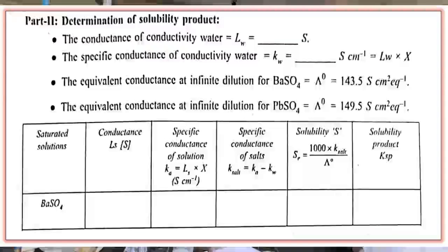Similarly, we can take another salt also, lead sulfate or any sparingly soluble salt, and we can determine the conductance of that sparingly soluble salt. So the experiment is very simple. We have completed the experimental part here.